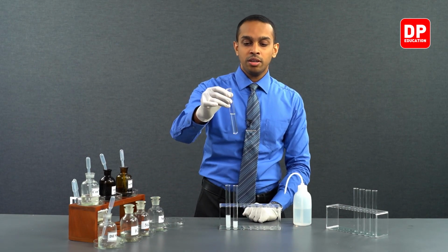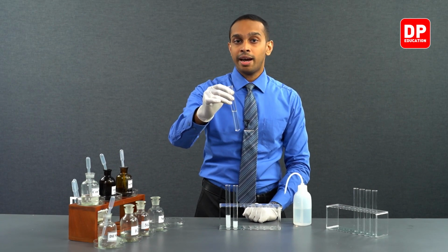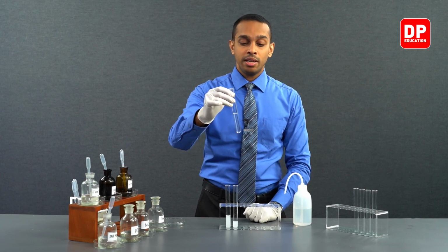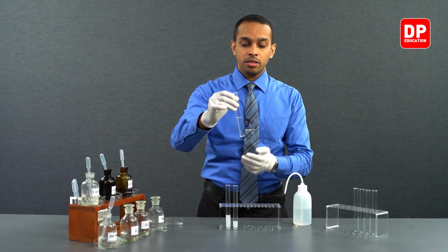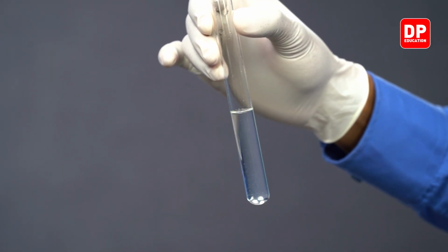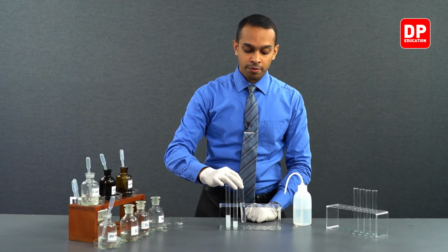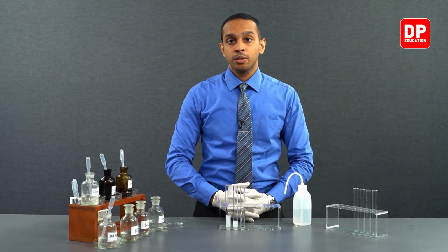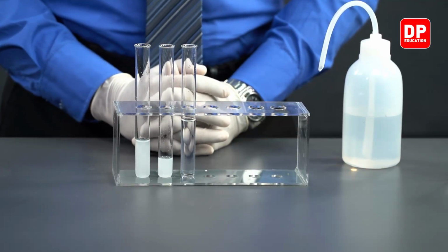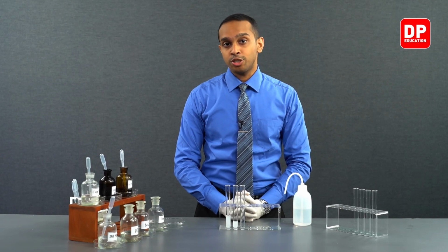And then later on, we took a little bit of silver chloride solid and reacted with dilute ammonia. Dilute ammonia, as well as concentrated ammonia, is capable of dissolving silver chloride solid. You can see a completely clear solution here because all of the silver chloride has been dissolved in the presence of dilute ammonia. So those are the reactions that we can do with chloride ions and silver nitrate.